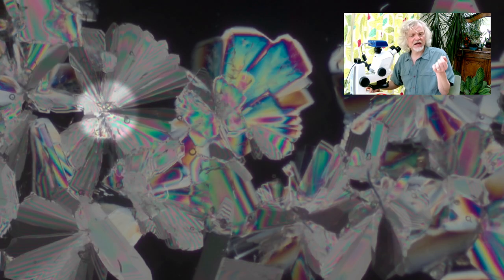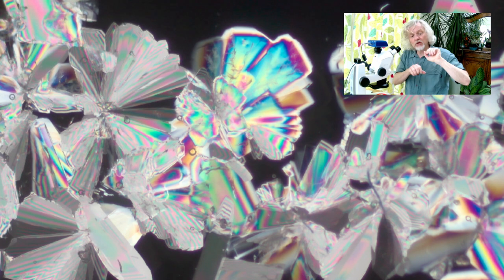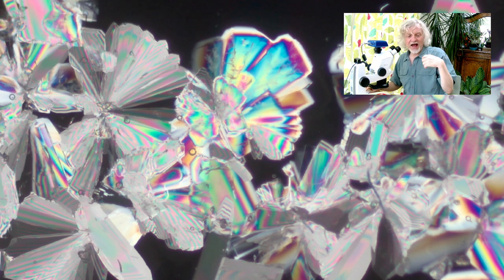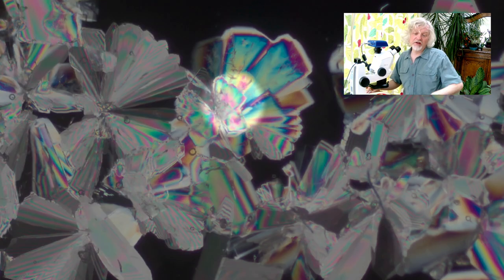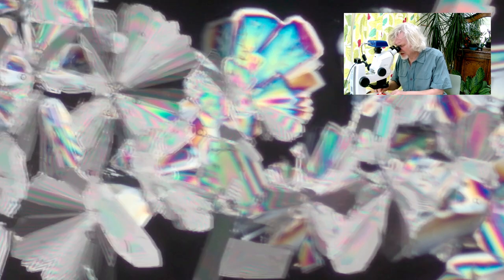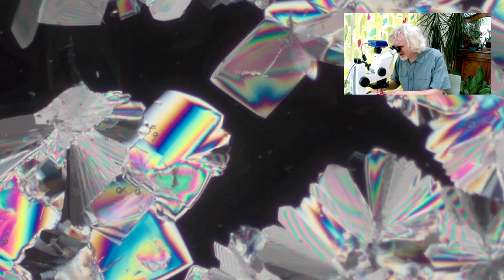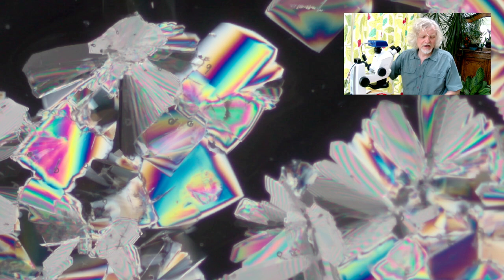There's probably a little speck of dust or something there that started it. The crystals, the monoclinic crystals, they're growing out in straight strands. They don't form cubes. They form these straight strands if you grow them flat. And here, because of the very thin nature of this, you get all these lovely colors. In the corner there, there's a really nice sort of rainbow splat there. Let's have a look at that. Let's bring that into the center. That is really rather lovely, that section. Look at that. Isn't that pretty?